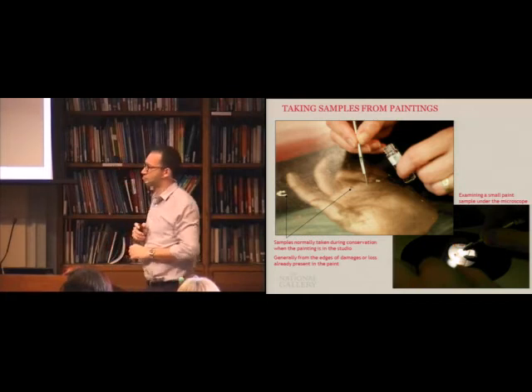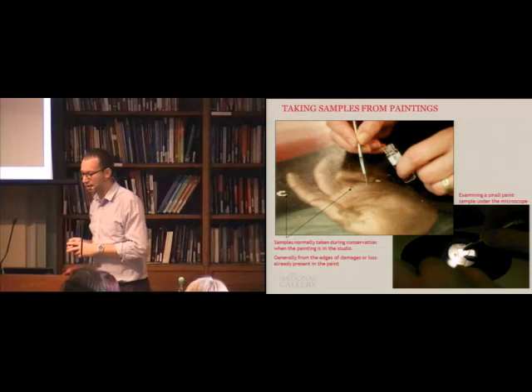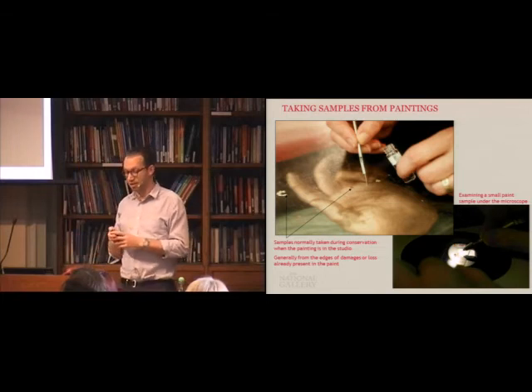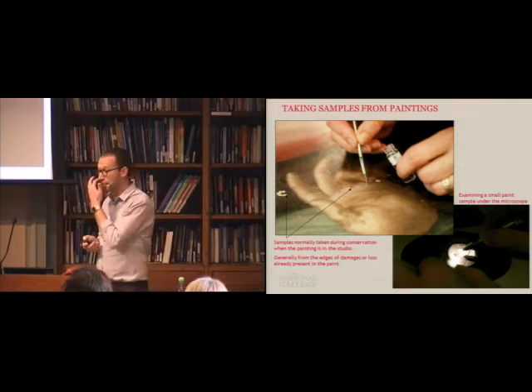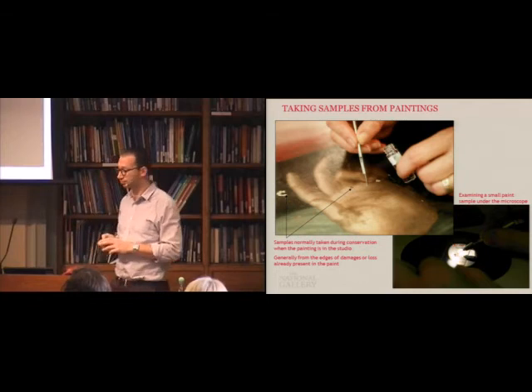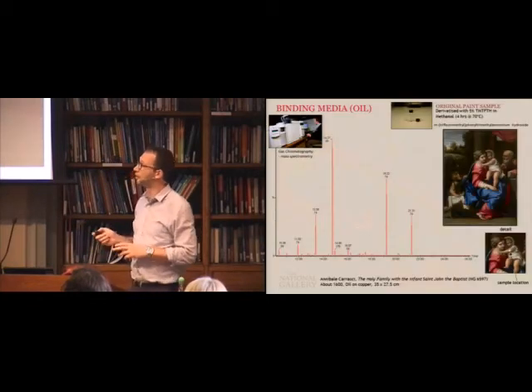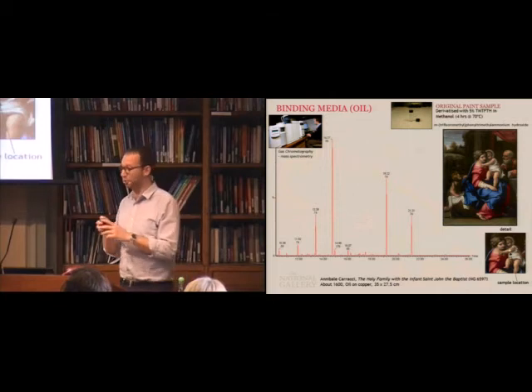So we've now done pigments and the binder. Now we want to think about how we investigate them. It would be great if I could tell you that we don't ever have to take a sample, and we can do it all with non-invasive methods. But we do take samples. We take very, very small samples, though. And when we take a sample, because I'm an organic chemist, the other thing I want to do is put in a GCMS.